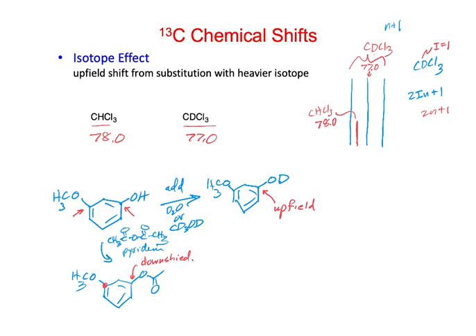And the important thing here, too, is if you start adding a lot of other solvent, you could just get chemical shift differences based upon solvent. So you want to make sure that your solvent is as similar as possible.